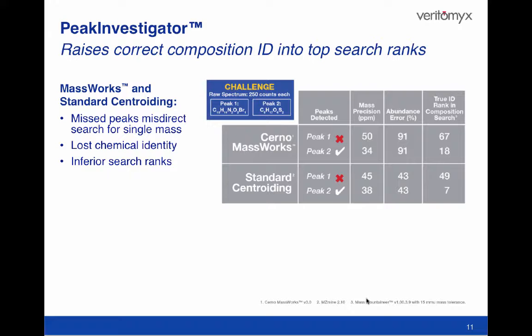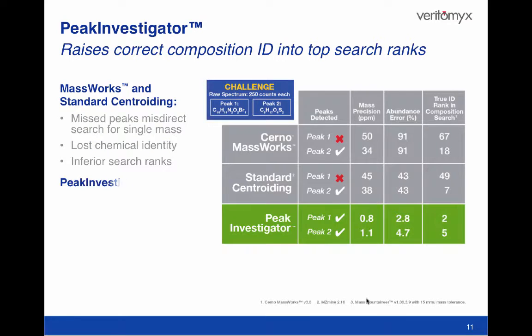R&D efforts that are misdirected by incorrect identifications can add expensive weeks or months to the investigation of lengthy candidate lists. Separation methods may need to be revisited before elusive hidden species are correctly identified and validated. The more worrisome outcome is when the correct biomarkers are never discovered.